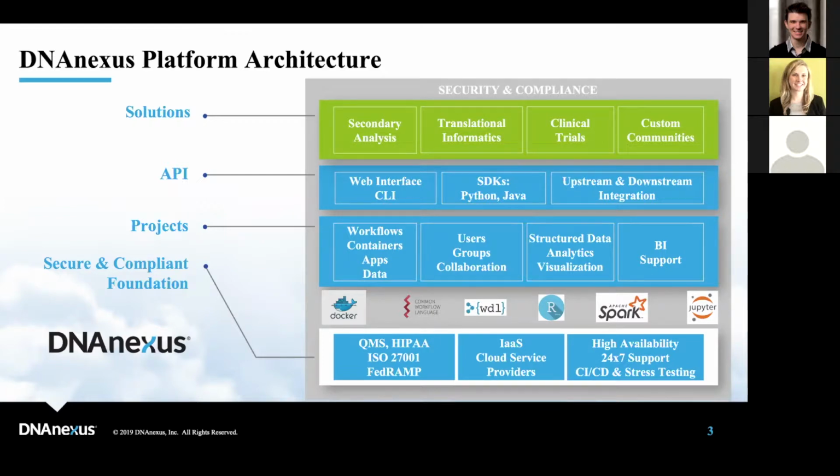We also realize it's important to support the commonly used workflow languages in the cloud. So you can see we support both Common Workflow Language and Workflow Description Language. What this means is if you have a workflow written in WDL, for instance, you can port that into DNAnexus using the DNAnexus command line toolkit.